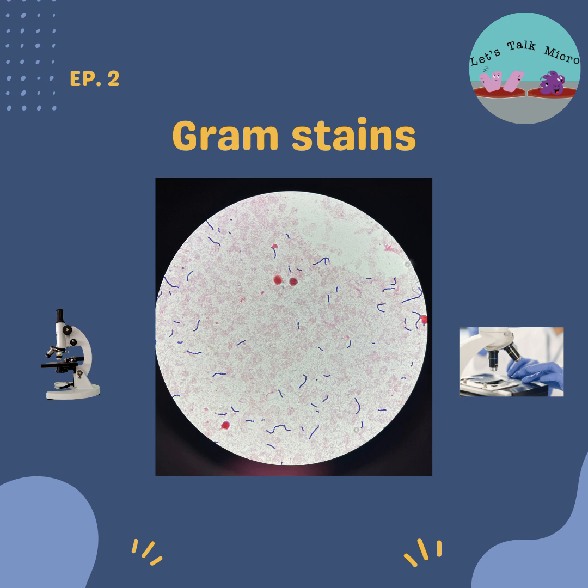Because if you're taking a test and you say selective for gram-negative, you're saying that Neisseria can grow on it, and that will be incorrect. So you have to be specific. You might end up losing points in your exam. And then MacConkey is also differential for lactose fermentation. So colonies that ferment lactose will turn pink on the agar.